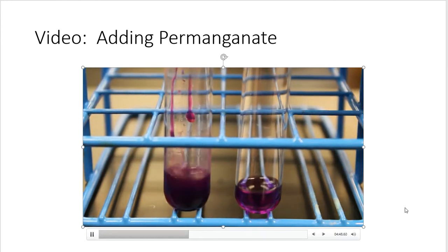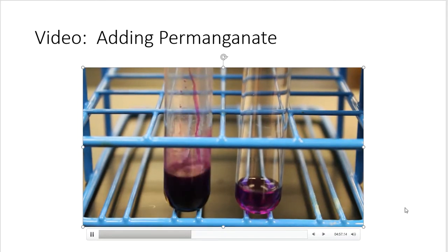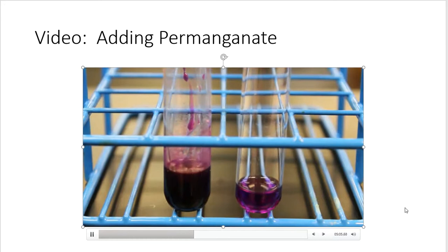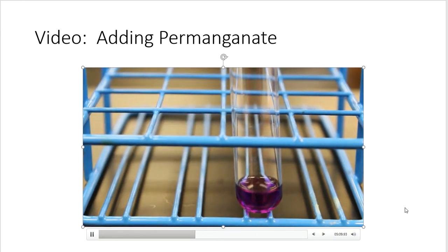So that's 10. There's 18. There's 20. Just looks like it got darker. Still purple.